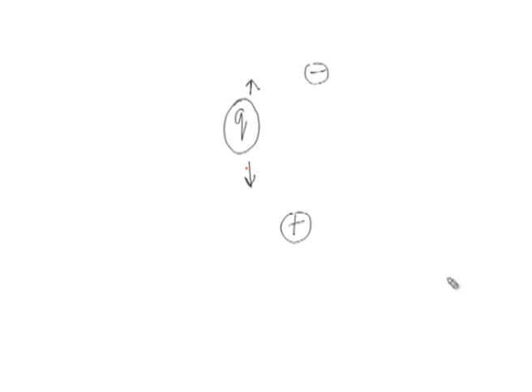Now, earlier when electrophoresis started with the work of Tiselius, it was mostly done in free solutions. So, there were a lot of problems of diffusion and other things. We will come into that a little later.